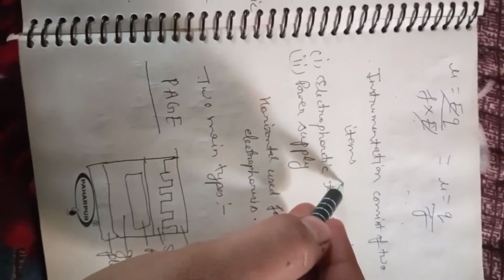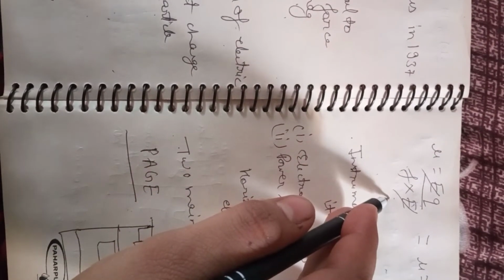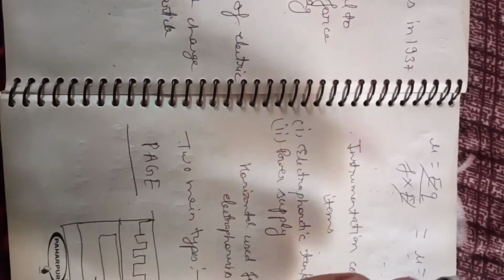Under the influence of an electric field, these charged particles will move toward either the cathode or the anode depending upon their charge. This phenomenon is called electrophoretic mobility, denoted by mu, and it is the ratio of the velocity of the particle to the field strength. So when an electric field is applied, the charged molecules will move and separate according to their electrophoretic mobility. In this way, from a mixture of charged molecules, we can separate each molecule in the form of a band.